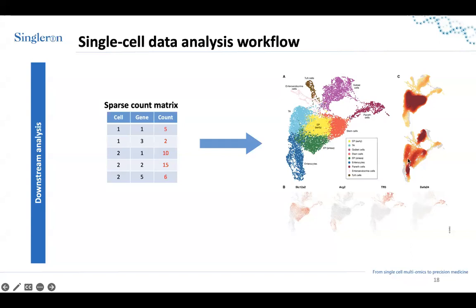And for sample 2, you have this population that arises, and this one as well at the bottom. So whatever the condition in sample 2 is, you understand that goblet cells seem to play a major role there, or the enterocytes as well. This is an intestine sample, as far as I see from the list of cells that we see.